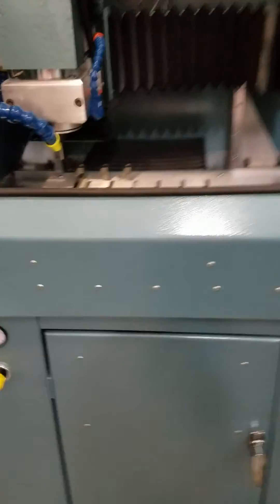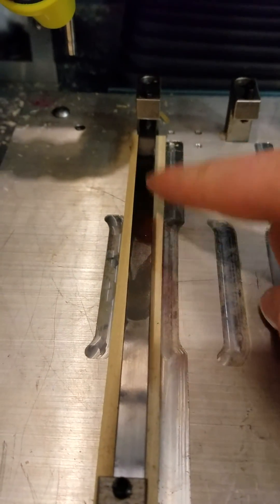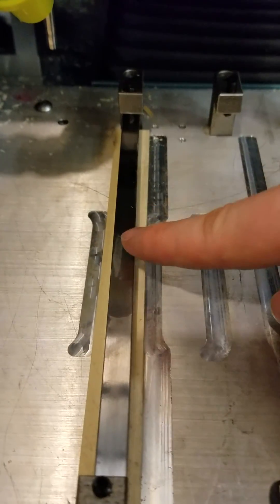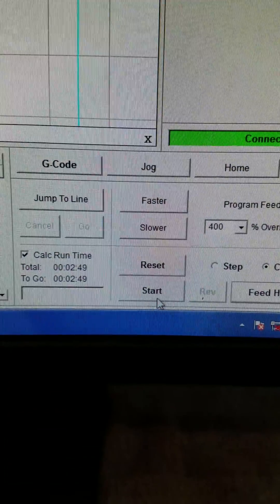This is going to be a quick TK3 demo video. What we're going to do is a very fast run. We have a piece of software — it's actually a poplar. We have it already clamped in place, so we're ready to go. We have our two boot bit in place, and since that's the only one we're doing, we're leaving the other slots empty for the moment. Simple, easy to use Windows computer.